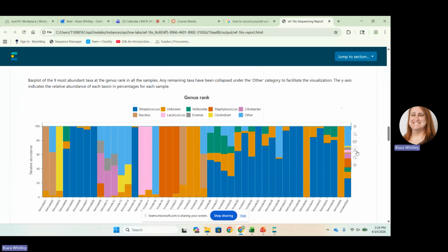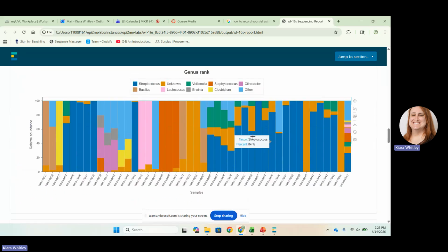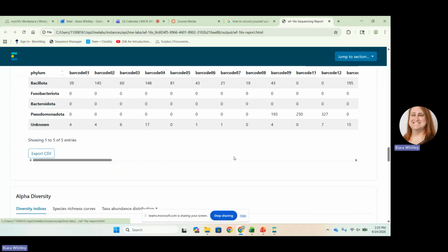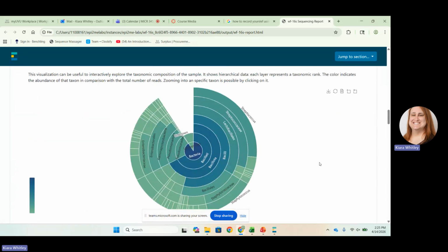Again, you can come right here to download the figure, and then apply it to, you can show this in your presentation if you would like, but ultimately it won't matter until you get to the final proposal. At this point, everything else from here is a lot of statistical values, but for the purpose of this class, you don't have to worry about them.